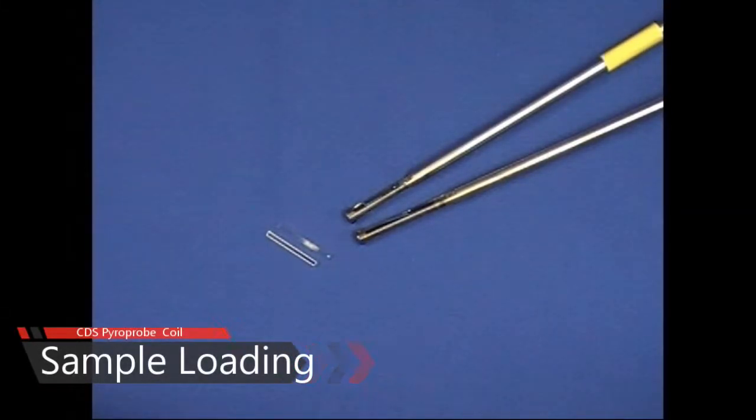The standard pyroprobe filaments come in two styles, a ribbon and a coil, and I'm showing them both here.